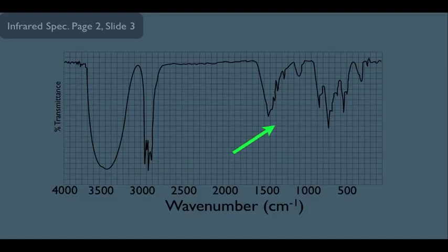But what I want to point out here is that in the actual IR spectrum, they don't put frequency on the x-axis, they put wave number instead. There's a good reason for this, but it's beyond this lecture at this point. Just know for now that there is a connection between frequency of light and wave number of light. And instead of thinking that absorption bands happen at certain frequencies, we can say absorption bands also happen at certain wave numbers. And just in case, let's know these wave numbers typically on the chart run from 4,000 all the way to 0.